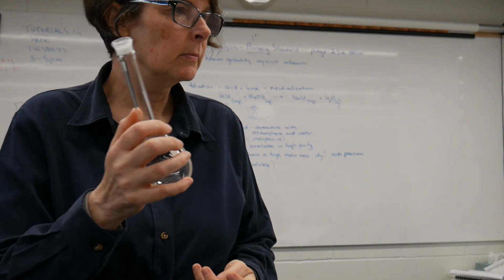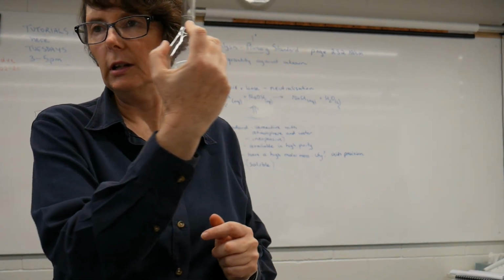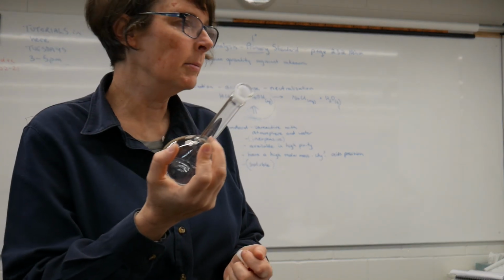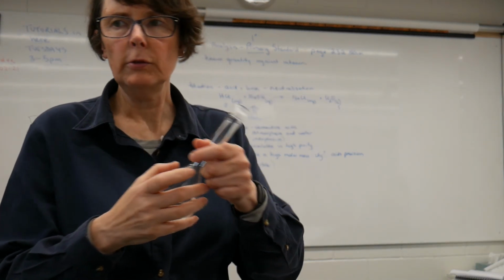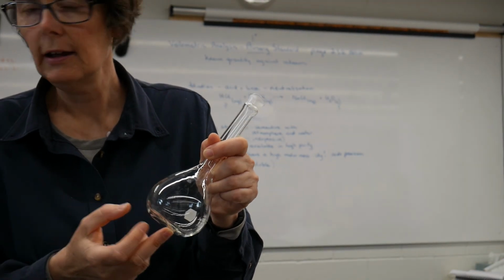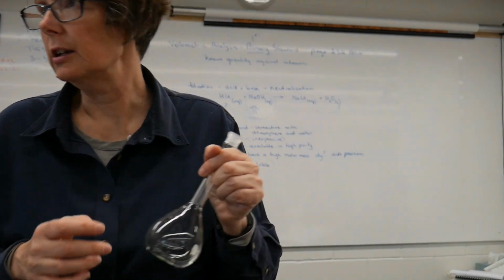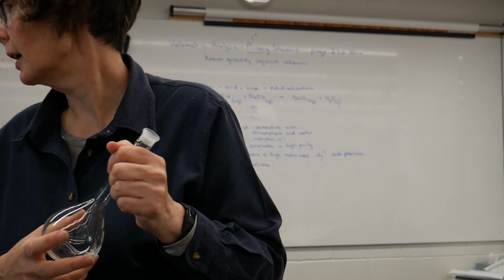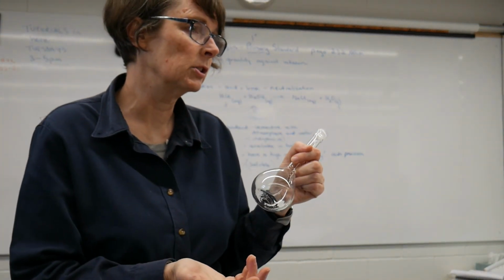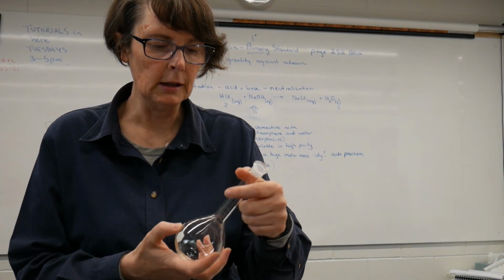For today's, we just want to probably fill it to about just underneath the fill line, and make sure your sodium carbonate's fully dissolved. If you transfer the sodium carbonate directly into the volumetric flask, only put a small amount of water in and shake until it's dissolved, okay? Because if you put too much water in, you won't be able to agitate it enough to dissolve the compound in there.